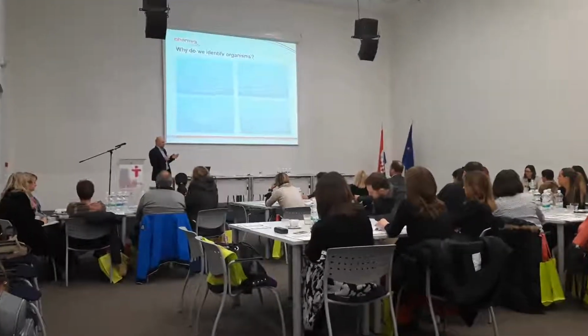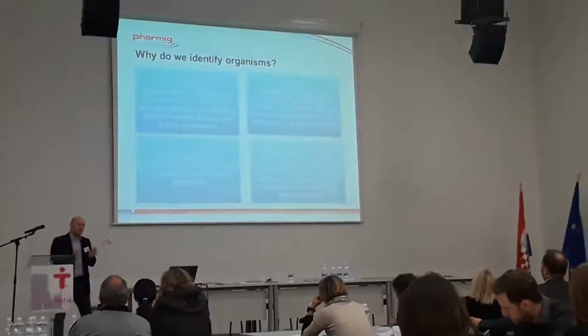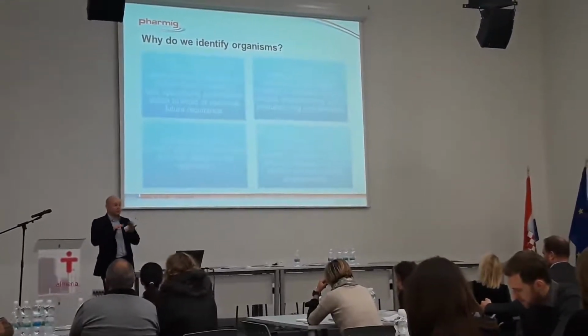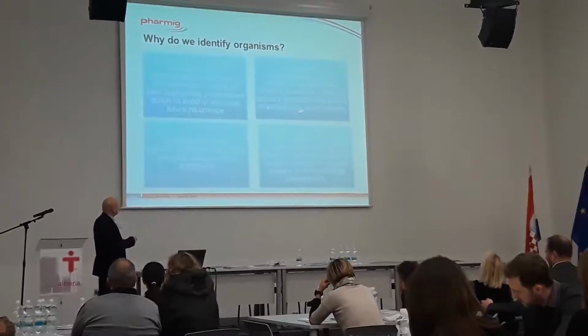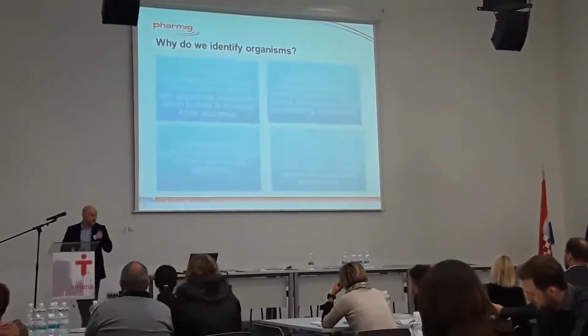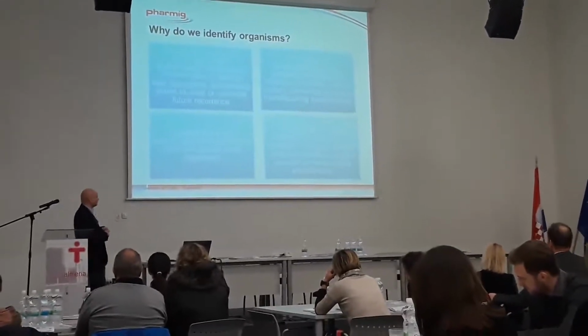Wrong, because that's when we get to go. But most of the time, we are demonstrating we're in control. So the most important identification system, the choice that you use, is demonstrating that everything is normal. Everything is okay. So that's your principal reason for doing identification.